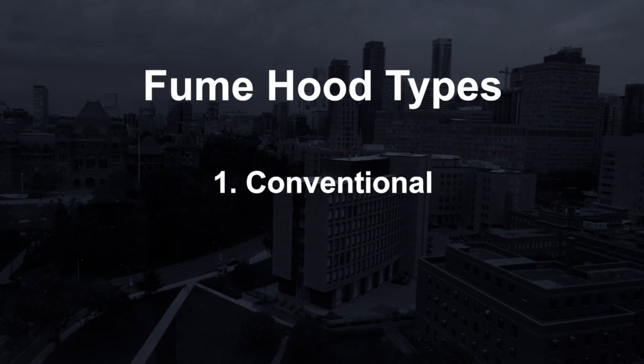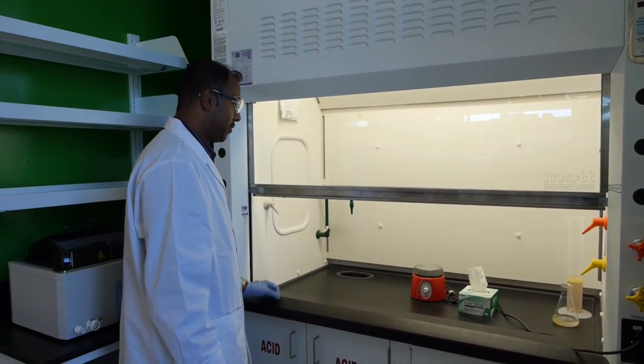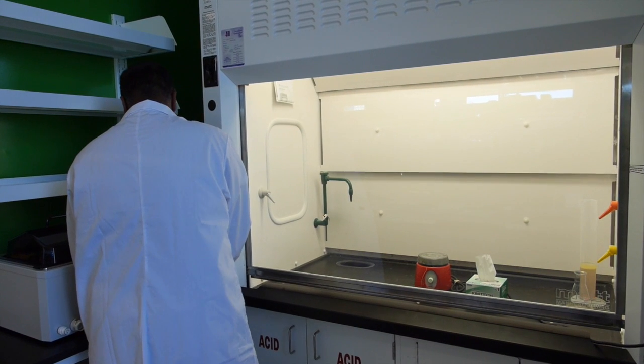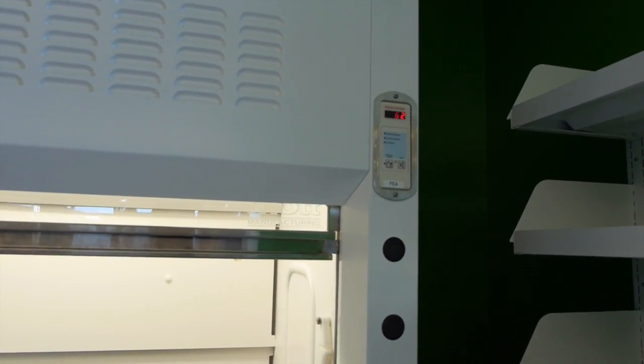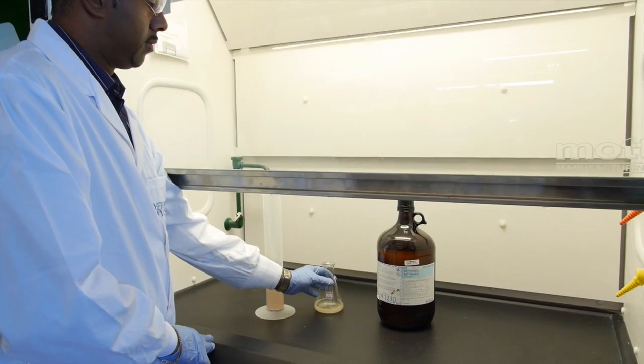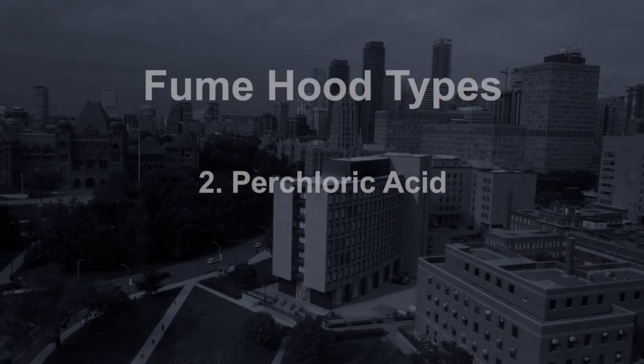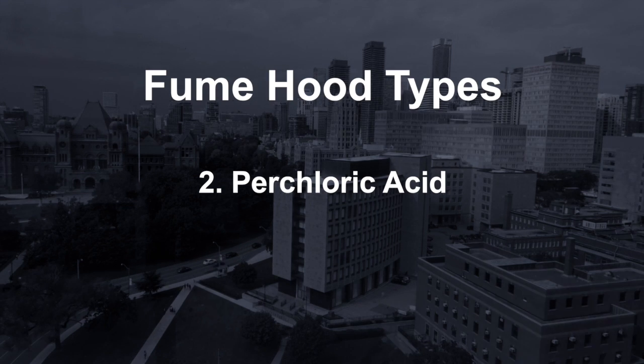Conventional fume hood. A partially enclosed workspace that's mechanically ventilated and intended to capture, contain, and exhaust gases, vapors, or aerosols generated within the enclosure. Perchloric acid fume hood.